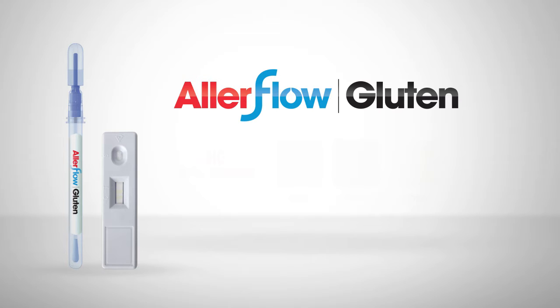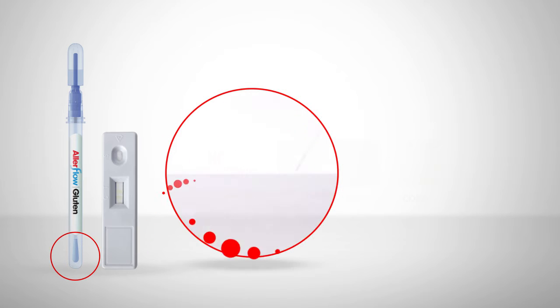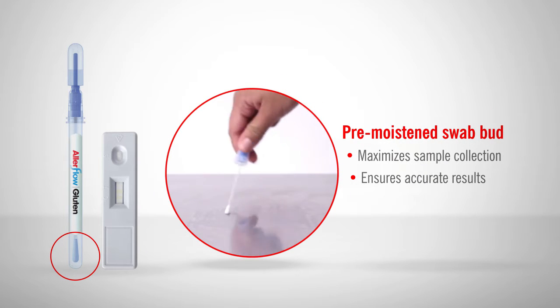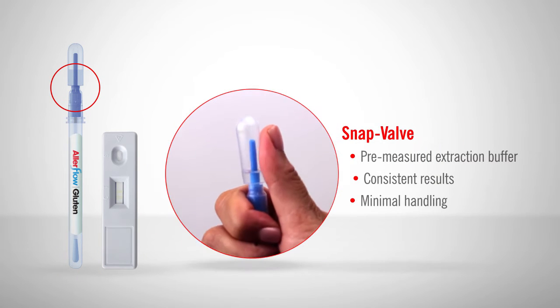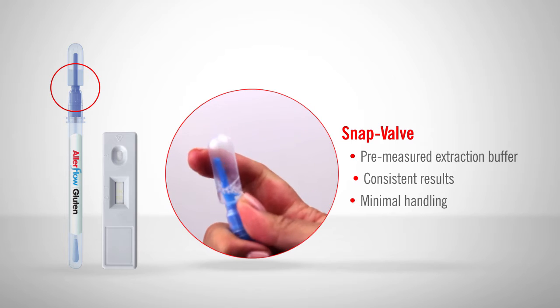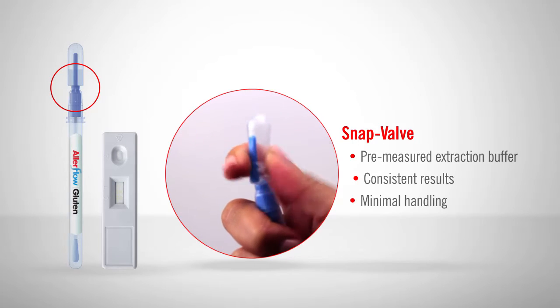Unlike other kits that contain several components, Allerflow Gluten consists of only two parts: a sample collection device and a lateral flow cassette. The sample collection device's pre-moistened swab bud enables reliable sample collection for accurate results. Hygiena's patented SNAP Valve contains a pre-measured extraction buffer that provides consistent results with minimal handling.